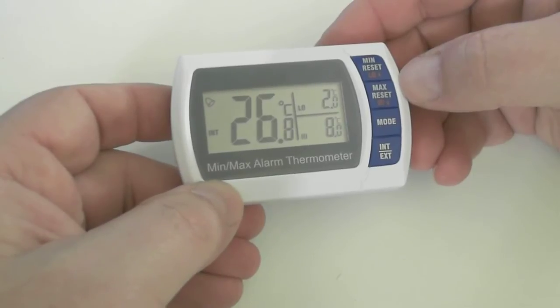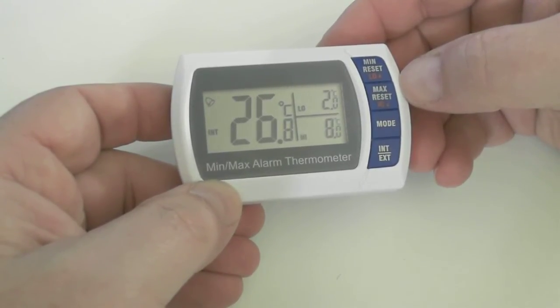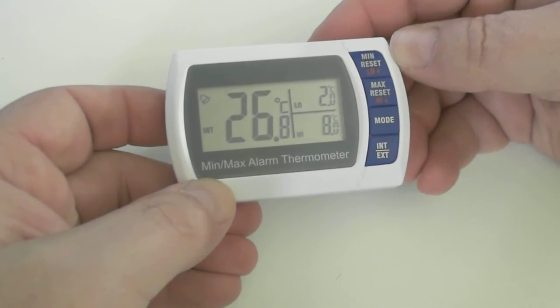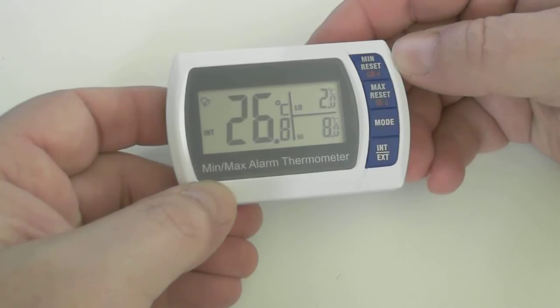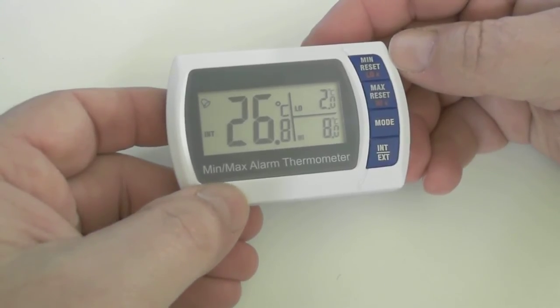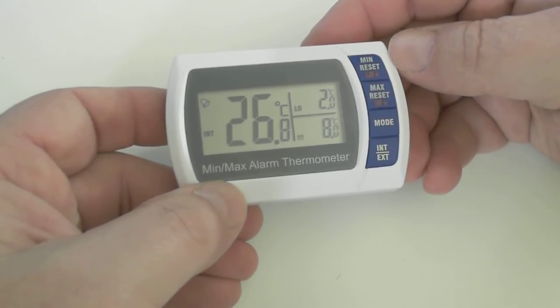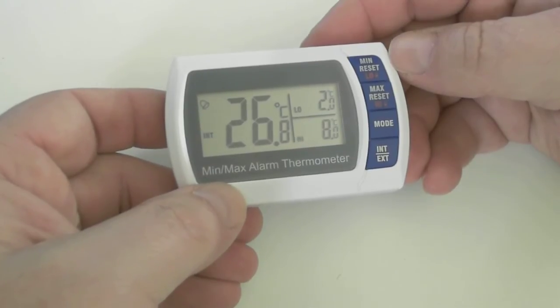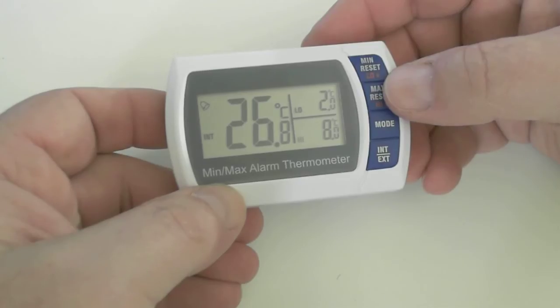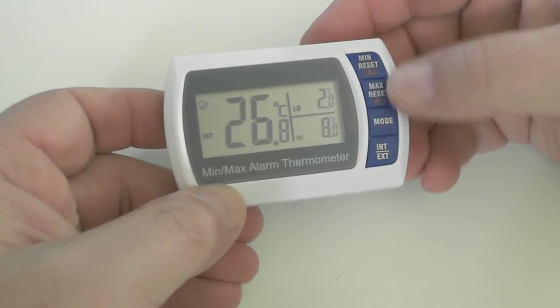Now we have triggered a high alarm due to the fact that the room temperature is 26.8 degrees. You get a visual indication on the LCD screen showing that the high trigger point has been activated. You also have an audible alarm that beeps 10 times, will be silent for a bit, and then will go 10 more times and continue. To silence the alarm, just press any button.